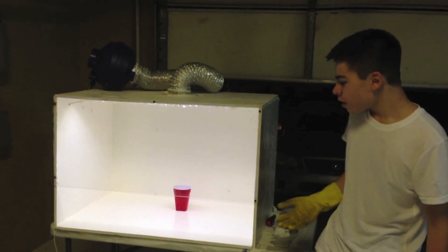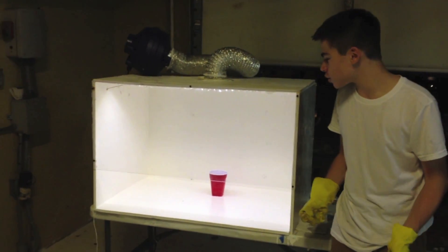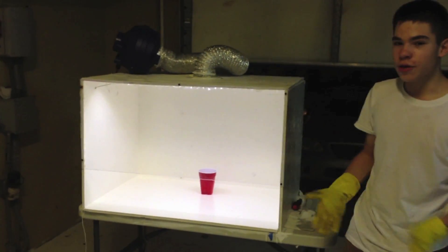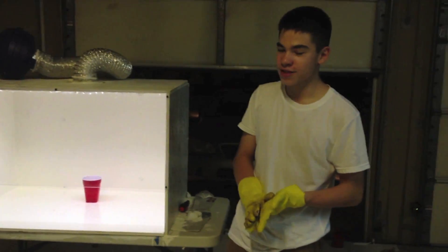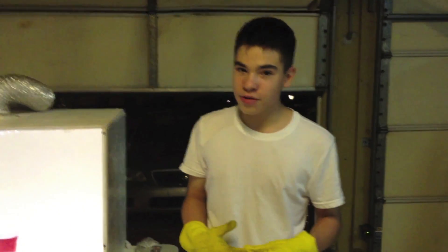The reason why I decided to start building this little chemistry area in my garage and build a fume hood is because I want to do fun demos with you guys and be able to do chemistry experiments that would normally be frowned upon if I did them in a research laboratory at FIU.